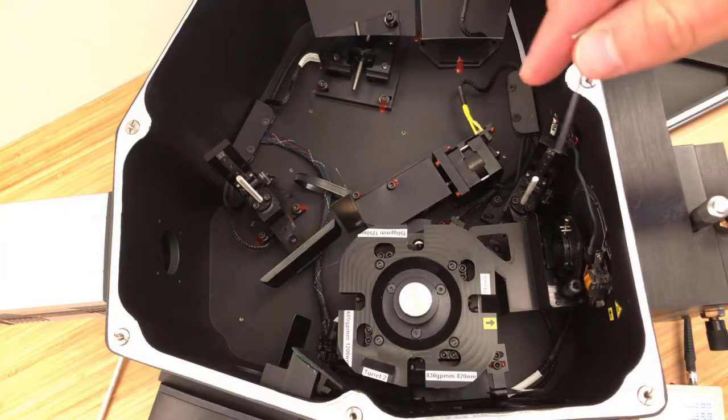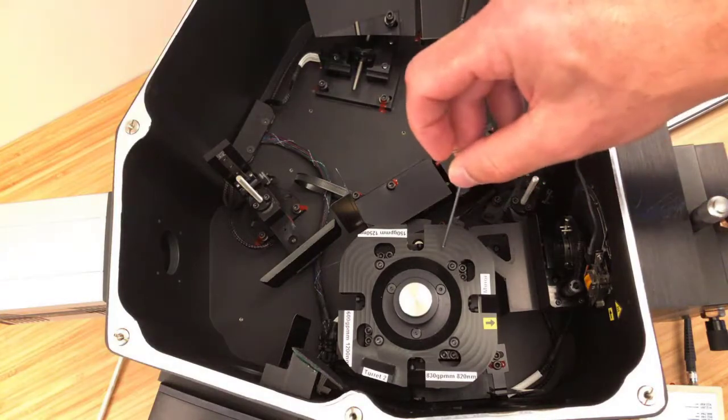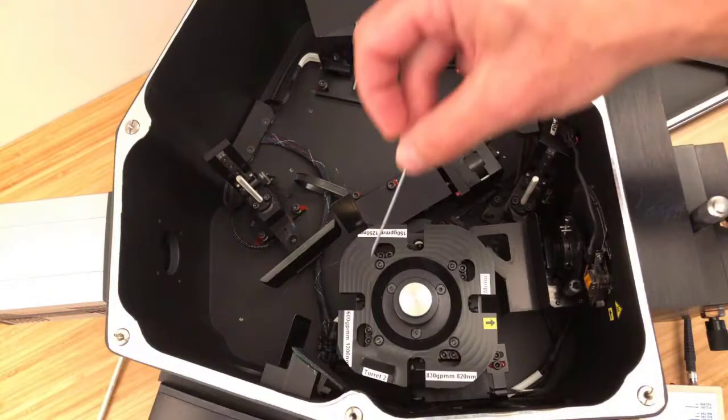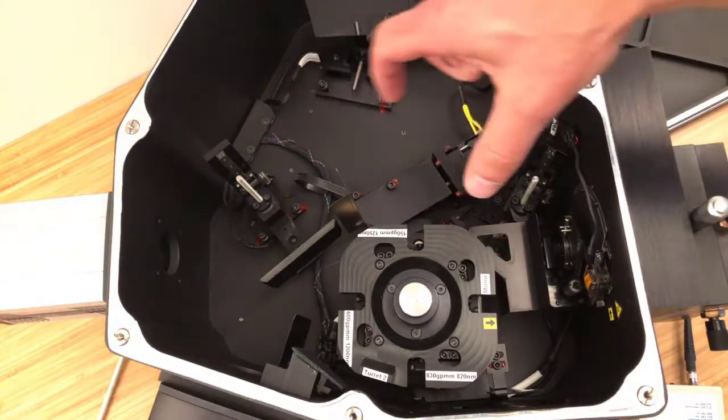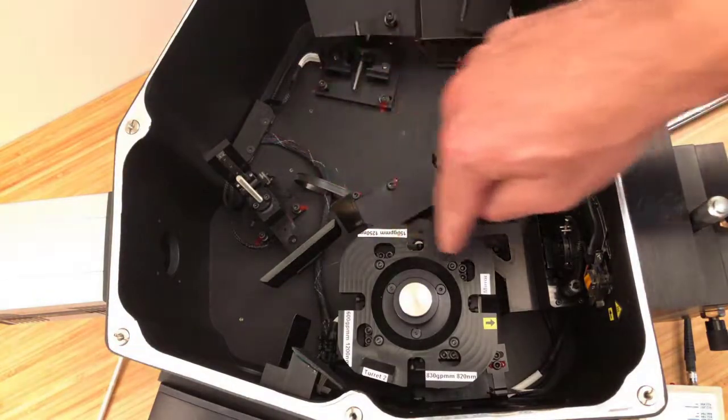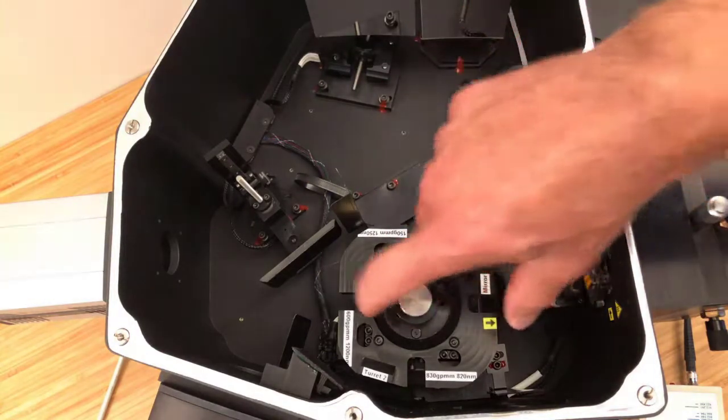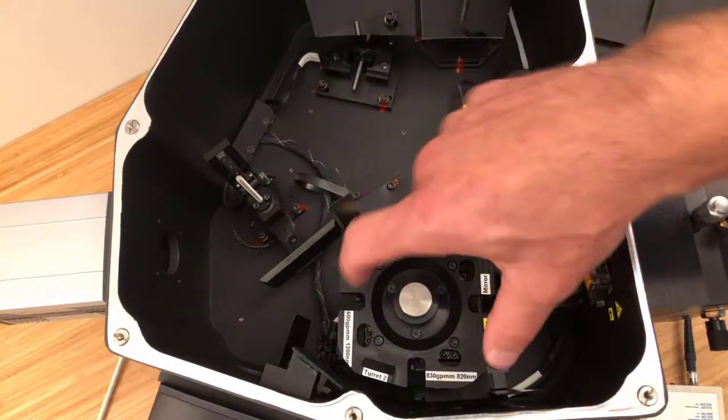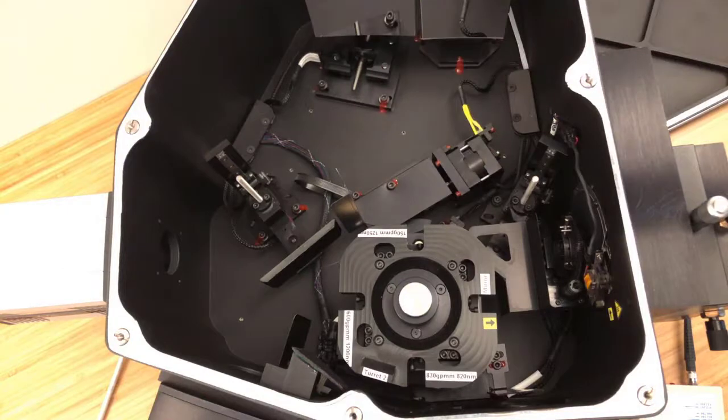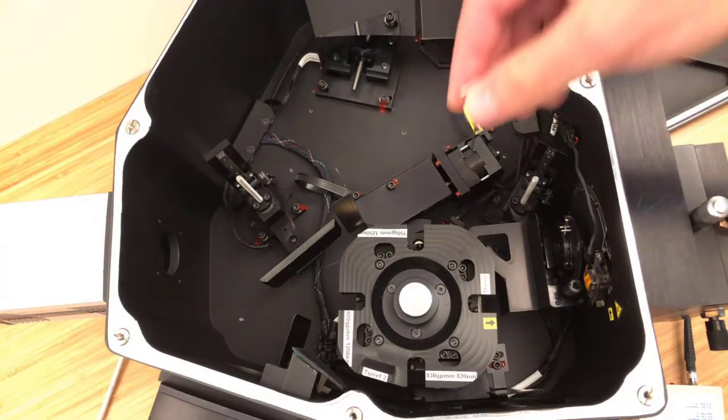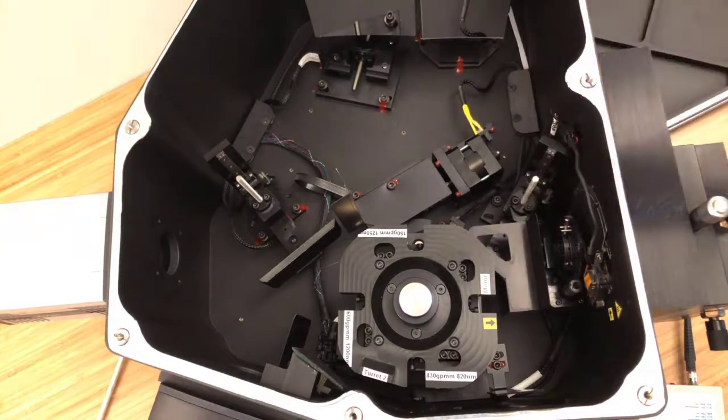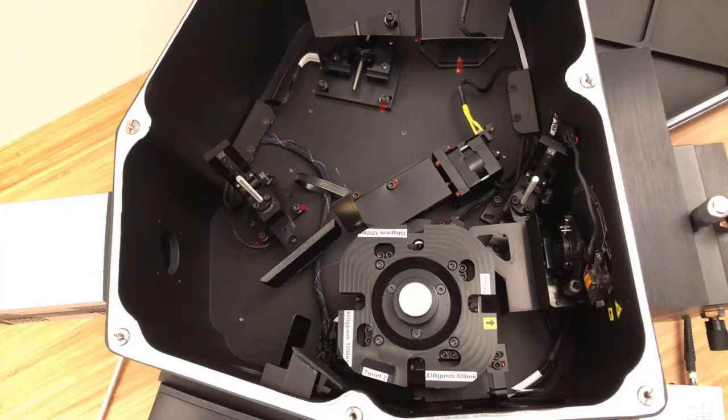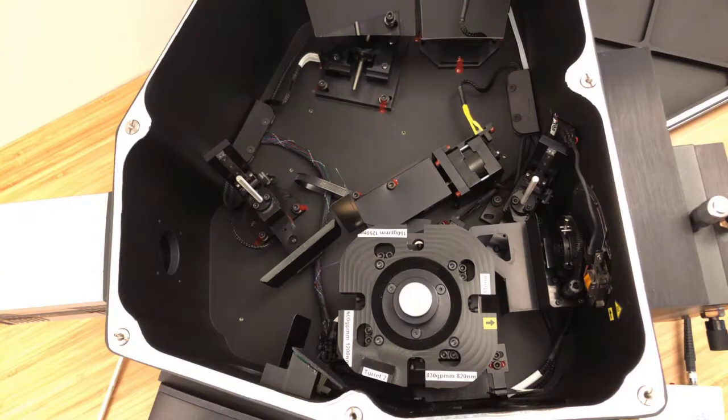And to backtrack a bit, the grating here is on a four-position turret. So this turret can turn around 360 degrees on one axis and then tilt to adjust the grating about the face of the grating to reduce any sort of optical aberrations that would be caused by adjusting the grating angle here. So it's actually two rotational degrees of freedom, one here and then one down here. We can hold up to four gratings per turret, and there's an RFID chip on the turret that actually tracks which gratings are in there. You can have any number of turrets, which are hot-swappable, and can be accessed through the turret hatch on the cover to keep from exposing the optics unnecessarily.